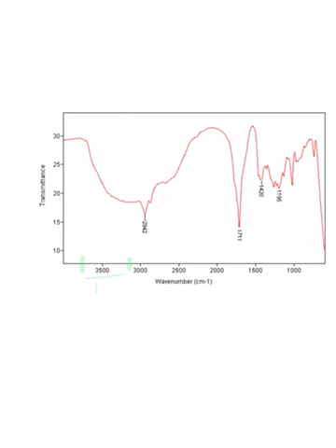Zone 2 is going to be from about 2700 to about 3200. Zone 3 is from about 2000 to 2300, so here to here, that's zone 3. Zone 4, we have from about 1600 to 1800. Then we notice we have something very sharp there. So that's zone 4. And then zone 5 is from about 1600 to 1400, so about here.